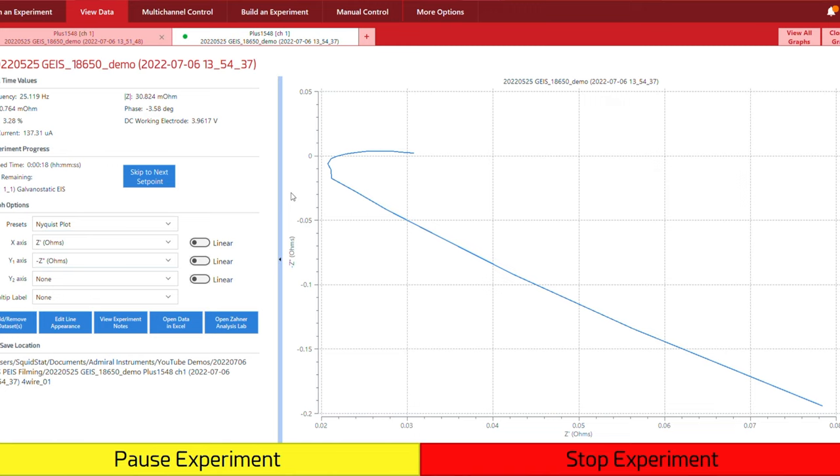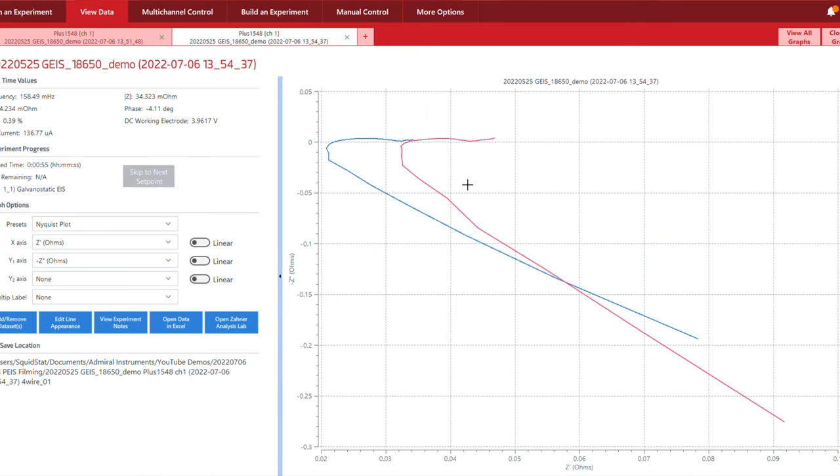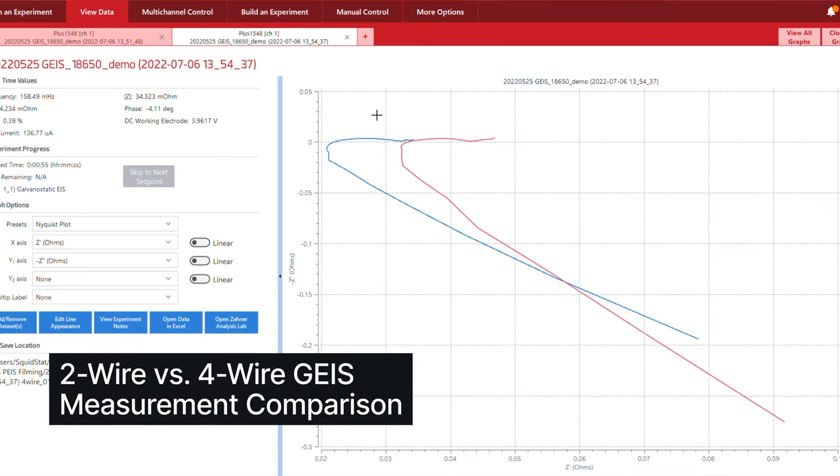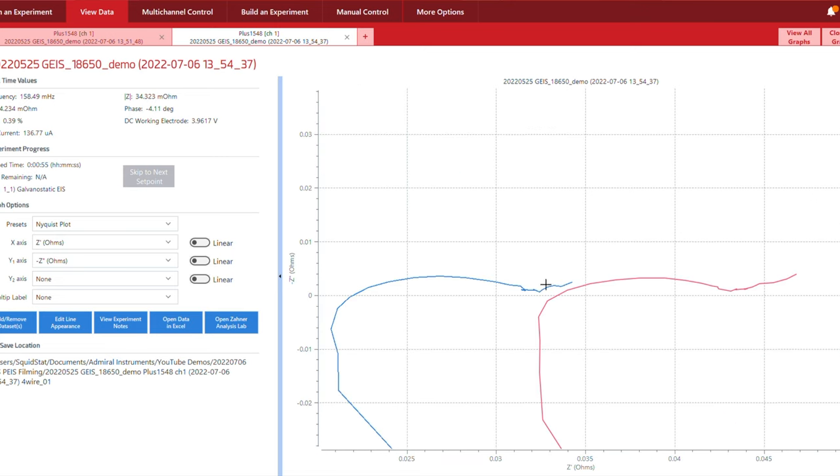Now that we've seen it's crossed the x-axis, we can zoom in. We can see where that impedance crosses the real impedance axis and the imaginary impedance goes to zero is around 0.02 ohms, maybe a little closer to 0.022 ohms. Here we have a graph comparing the data we just acquired on the two wire versus four wire measurement. As you can see in red is the two wire measurement, which has a much higher initial resistance or solution resistance recorded versus the four wire measurement, which has less initial resistance. Even though you have the same shape of the curve, that resistance is offset because you have extra resistance in the circuit itself — that voltage drop is present.